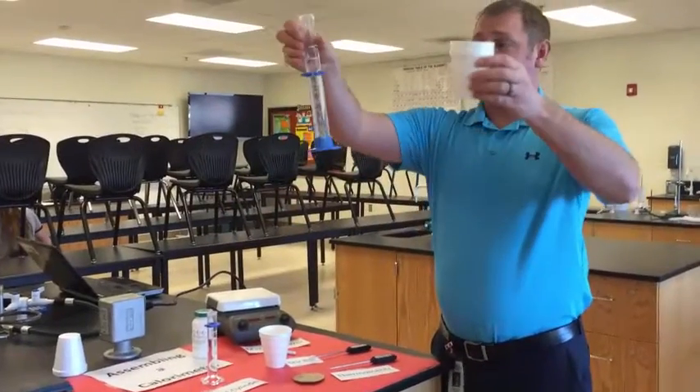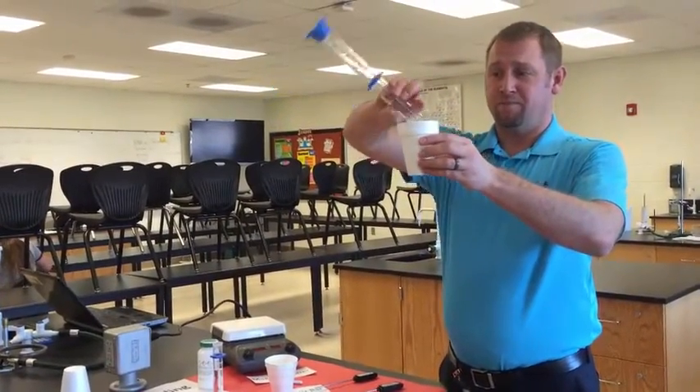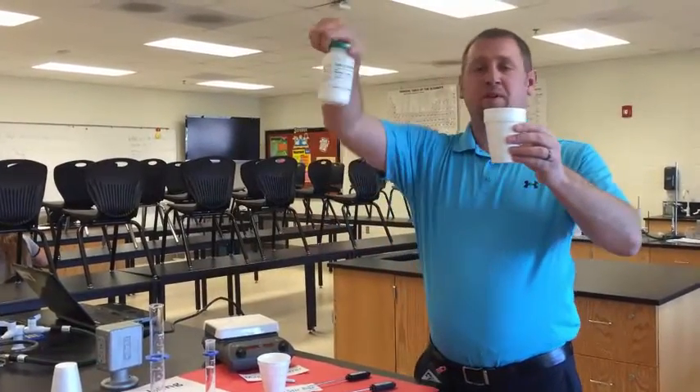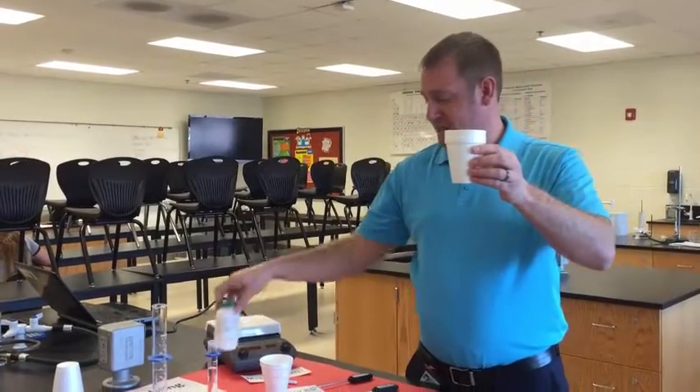In most cases you will add 100 milliliters of water to the foam cup. You will measure a predetermined amount of solid — in a lot of cases it's about 5 grams — and add it to the cup.